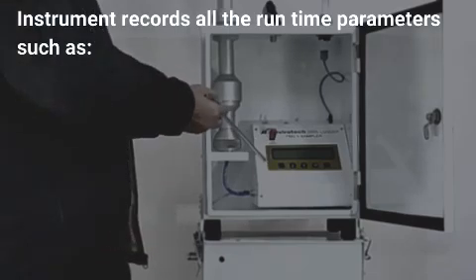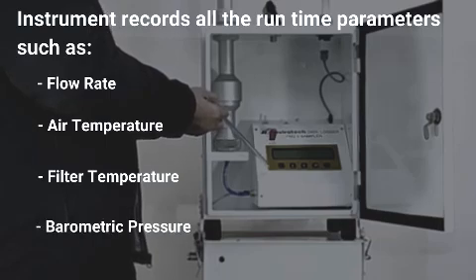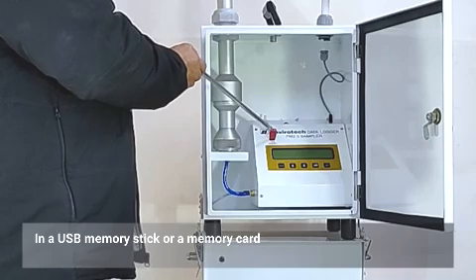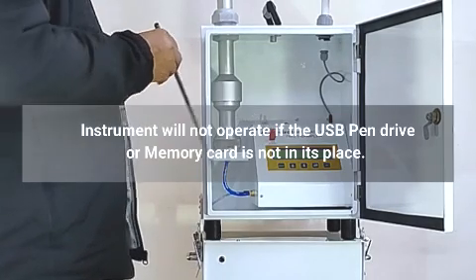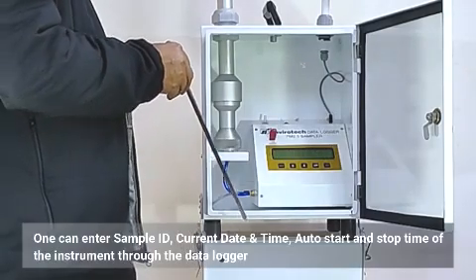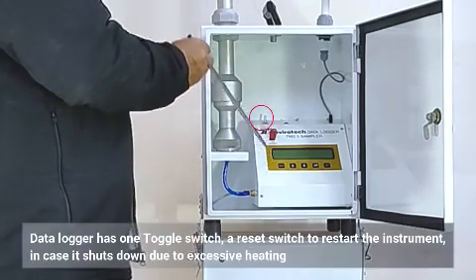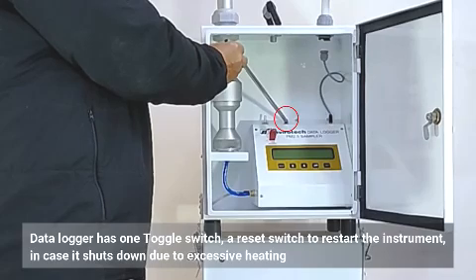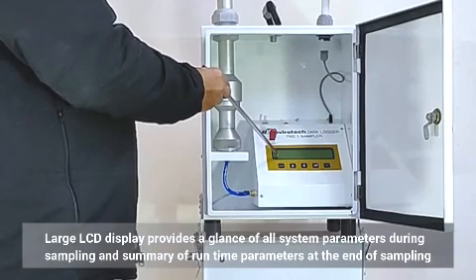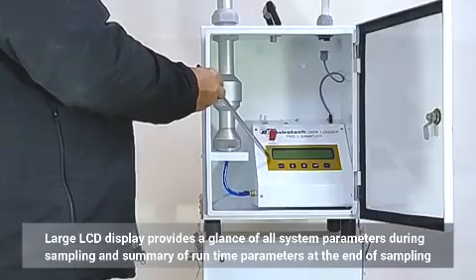The instrument records all the runtime parameters such as flow rate, air temperature, filter temperature, barometric pressure, filter pressure, sample volume, etc. in a USB memory stick or a memory card. The instrument will not operate if the USB pen drive or memory card is not in its place. One can enter sample ID, current date and time, and auto start and stop time of the instrument through the data logger. The data logger has one toggle switch, and a reset switch to restart the instrument in case it shuts down due to excessive heating. A large LCD display provides a glance of all system parameters during sampling and a summary of runtime parameters at the end of sampling.